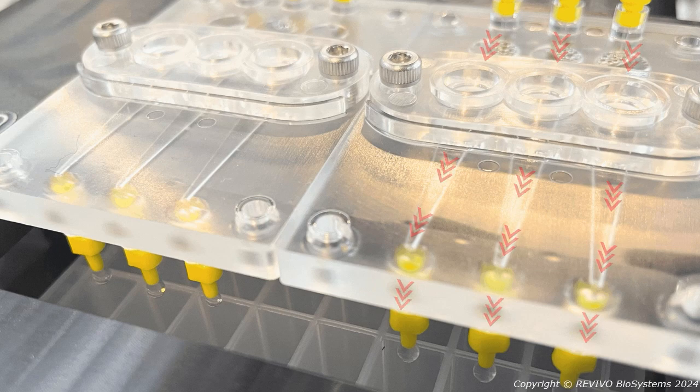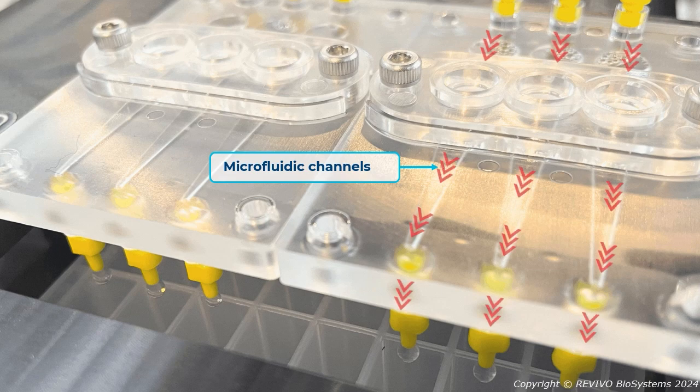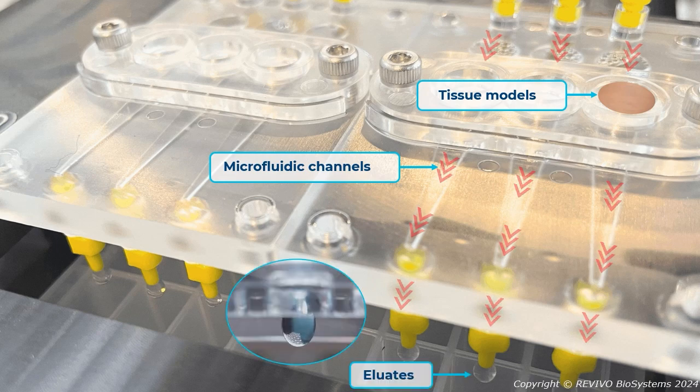Finally, let's zoom into the three key features of an organ-on-chip device. The microfluidic channels. The microfluidic channels enable dynamic culture of cells and tissues. The flow of media and reagents mimics the function of the blood and interstitial flow, thus creating a natural human physiological environment in the in vitro model. The tissue model. Tissue models can be real tissue explants or lab-grown tissues based on human cell cultures. Depending on the microfluidic design and application needs, topical and/or systemic treatments are applied to understand their effects. The eluates. Integrating tissue models and microfluidic channels is a powerful approach that allows you to better understand the treatment-tissue interaction by analyzing the soluble factors in the eluates.